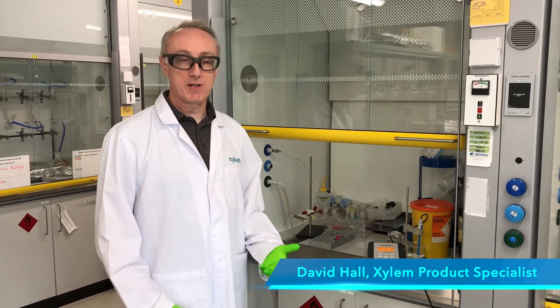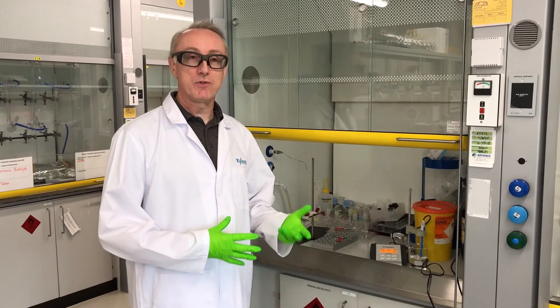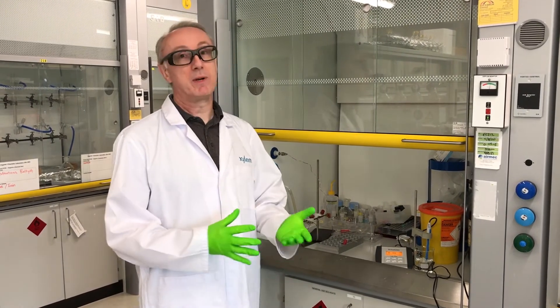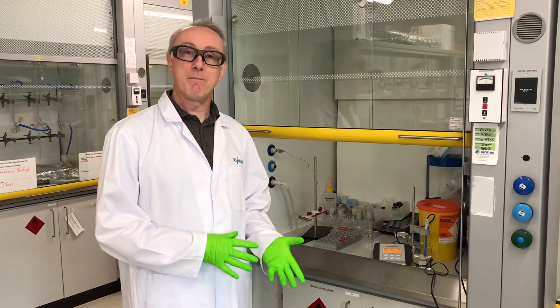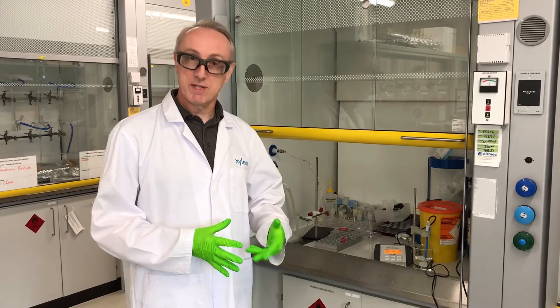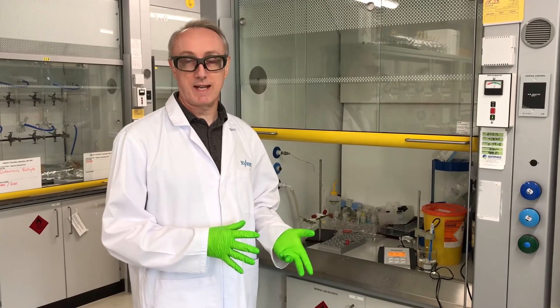Hi, my name is David Hall from Xylem. I'm the product specialist for the Electrochemistry range of products. I look after W2W and I want to give you a quick resume today — it's a classic analogue technology that everybody has probably been used to for a long time, and how that might compare to the digital wireless technology that gives users potential advantages now. I want to try and illustrate that in as short a time frame as I can.